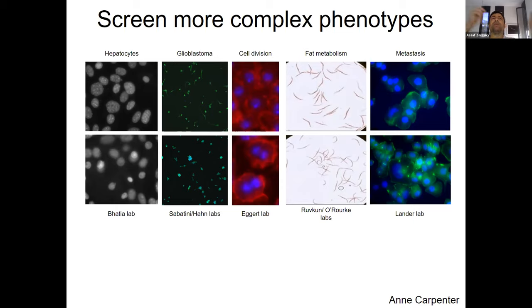Sometimes it's really hard, the communication. There is the computer scientist and there is the cell biologist, and the cell biologist says, I know that this is treated and this is not, based on the phenotype, but explaining to the engineer how to extract the features, for example, is hard. Now, with deep learning, the idea of not extracting features in advance and letting the machine learn the features is becoming more acceptable across these domains, but this is the idea in principle.